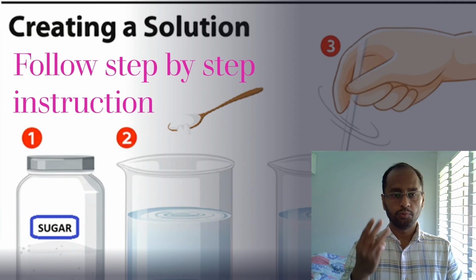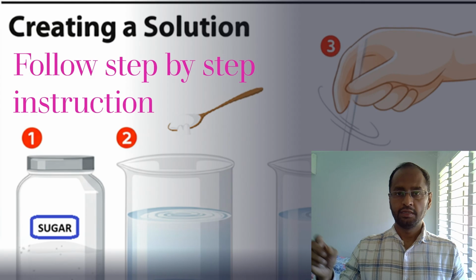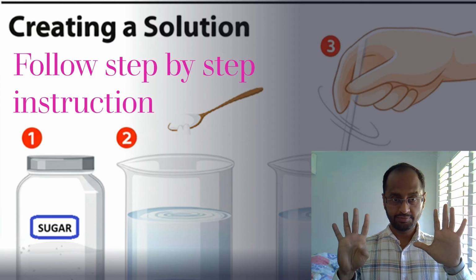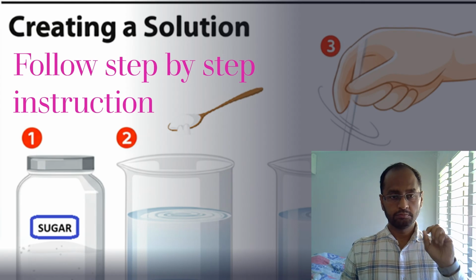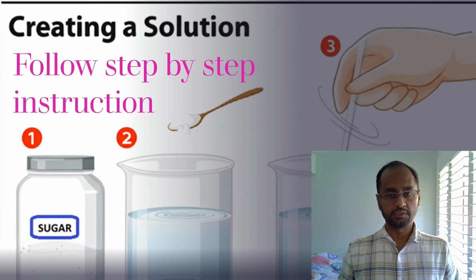So you will do warm water 3 times before you move on to the hot water, which is there in the kettle, and then with the cold water, which is there in the ice bucket. So you will do 9 times. So 3 times with warm, 3 times with hot, and 3 times with cold. You will also be able to record every single one of those experiment results.